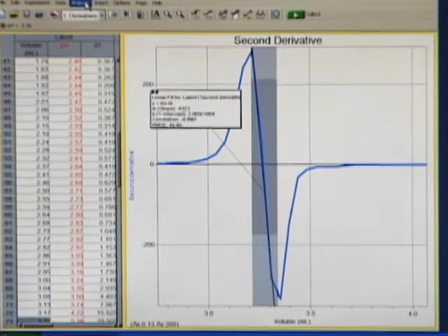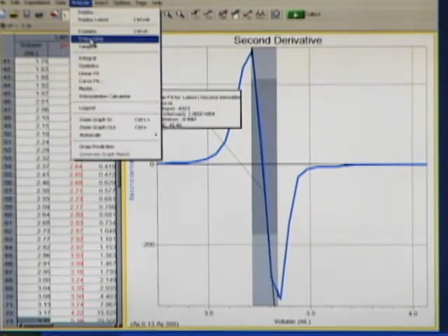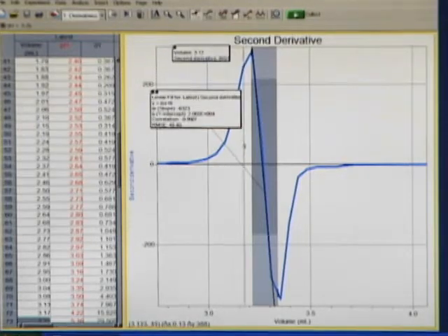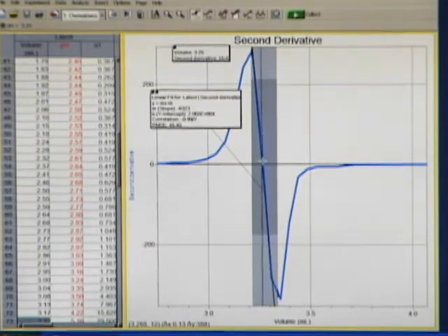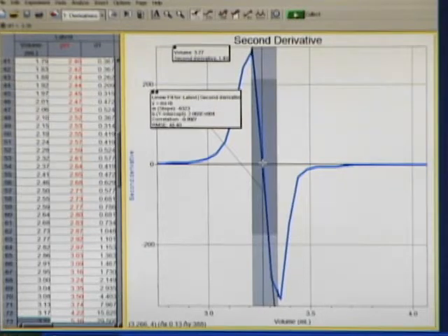I then go to Analyze and Interpolate, which will interpolate along that curve fit line. And if I carefully move that around until my derivative is as close to zero as I can get it, right there, my volume is 3.27. That is the best number we can get for the equivalence point of that titration.